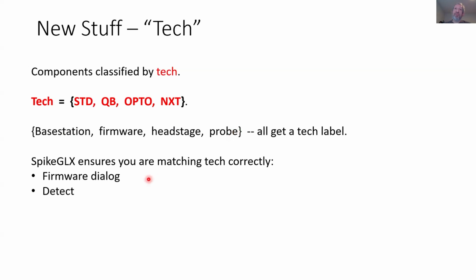So a tech label, but SpikeGLX is being designed to watch this for you, make sure that you're plugging things together and using components that are compatible, most especially in getting firmware installed on your modules. And when you detect to start a run, we look at the tech of everything, make sure that checks out.